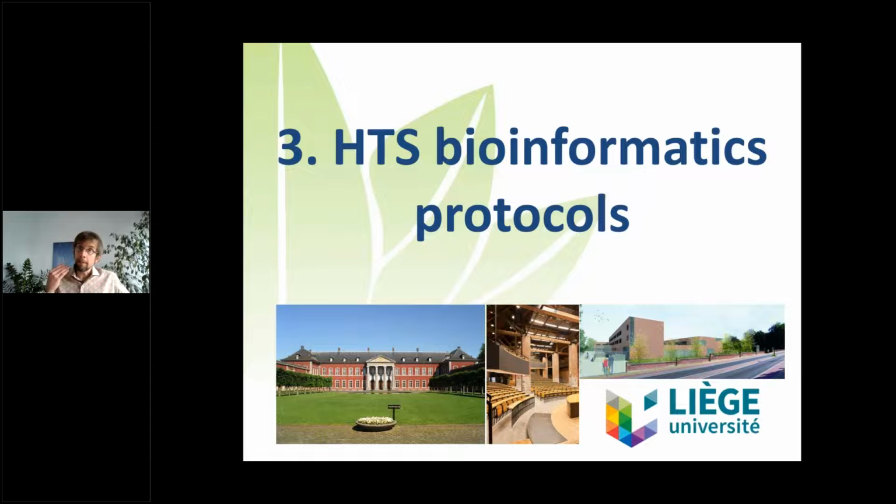If you look at the amplicon protocol, at least you need, for example, a DNA whose size is higher than what you want to amplify. If you target a region of 400 nucleotides, it's really advised in that case to have longer fragments. Yes, you could still amplify fragments because the fragment quality is like a Gaussian distribution. Even in a bad sample, you still have long fragments, but much fewer, and you will create bias. So that's important for that.